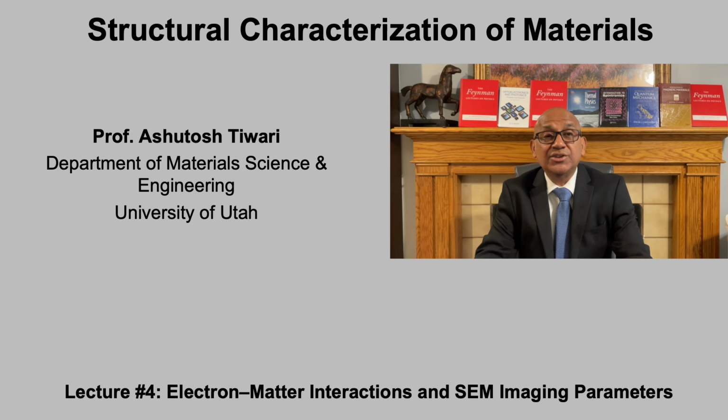In the previous lecture, we introduced electron microscopy and discussed why electrons are powerful probes for imaging materials at very small length scales. We examined how resolution is defined, why optical microscopy reaches a fundamental limit, and how the short wavelength of electrons enables nanoscale and atomic scale imaging.